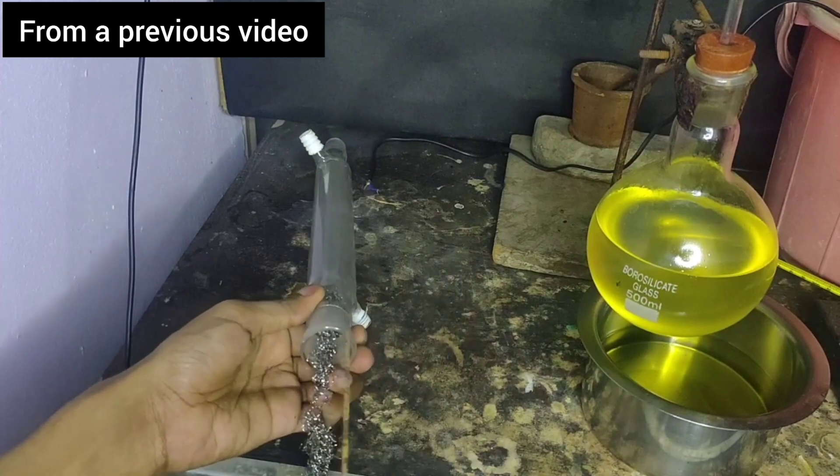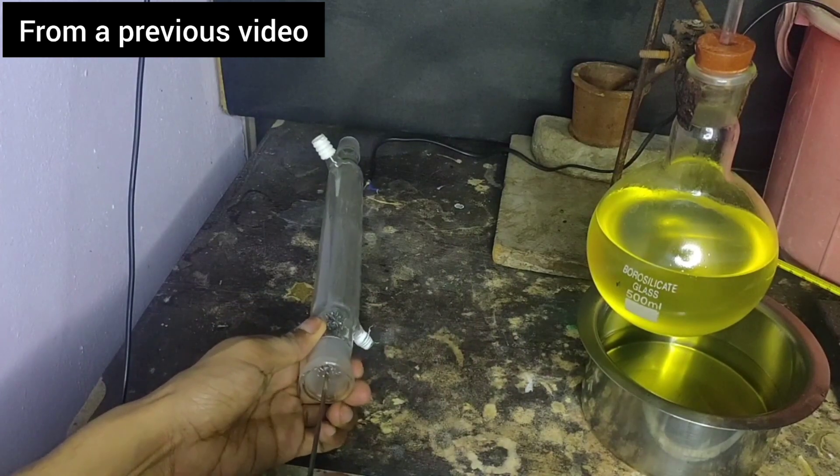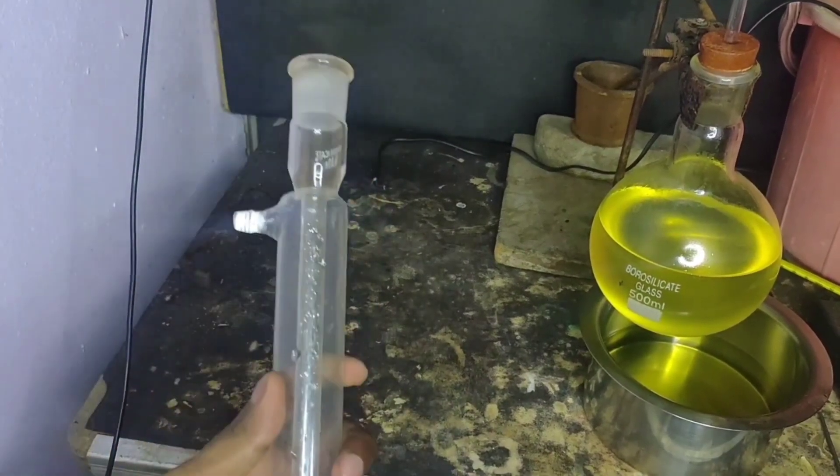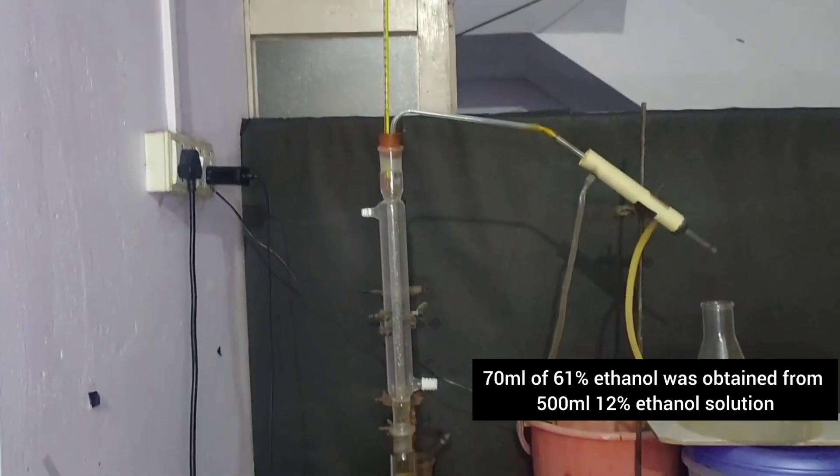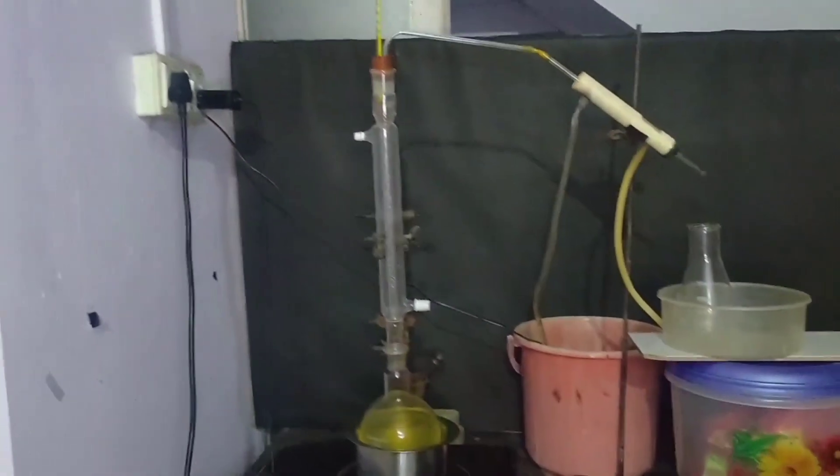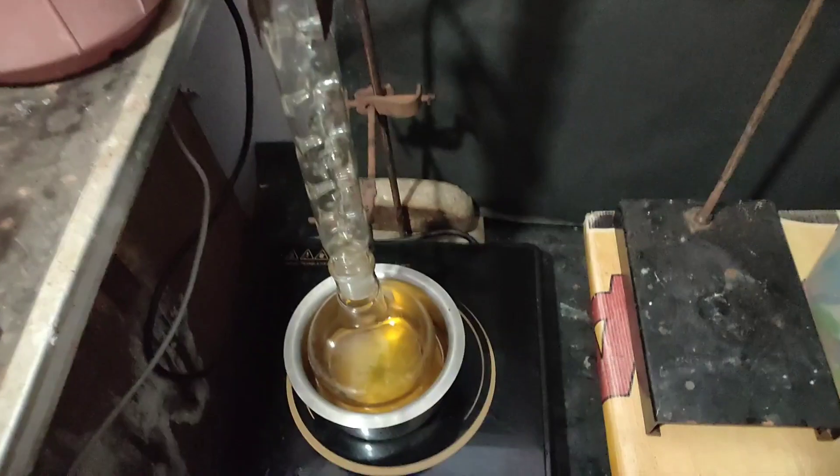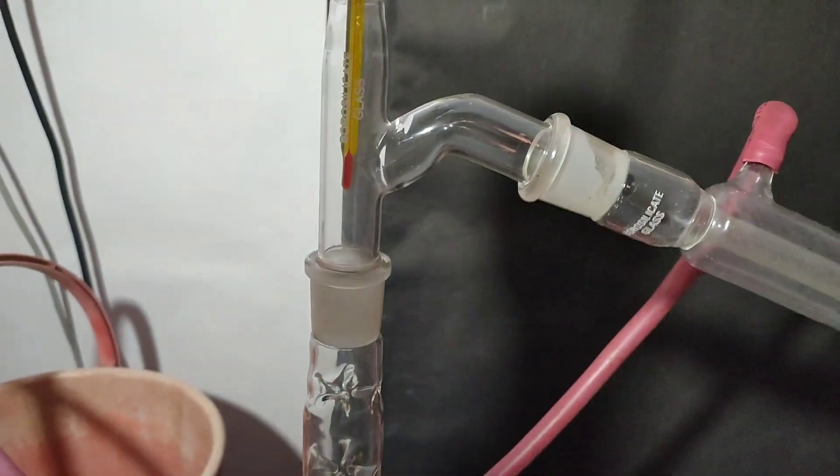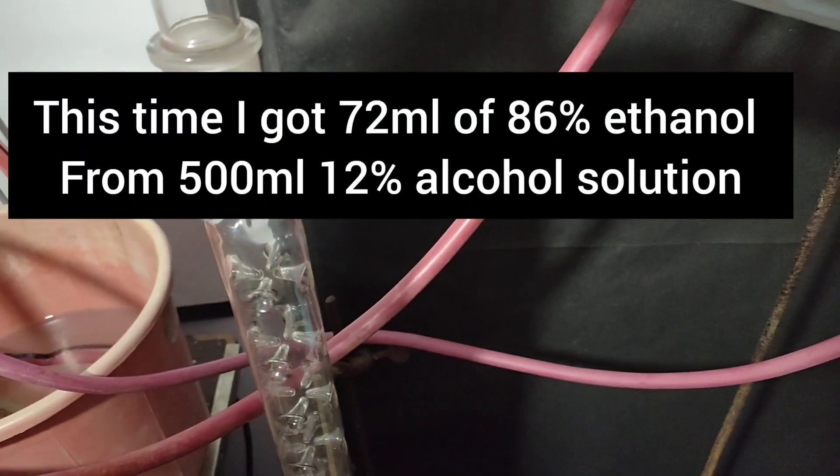If one doesn't have a fractionating column, one can pack a Liebig condenser with steel wool like I did in my alcohol making video. From 500ml of 12% alcohol solution we got only 70ml of 61% ethanol. Then I purchased a Vigreux column and again made ethanol the same way but without yeast. This time on distilling I got 72ml of 86% ethanol solution.